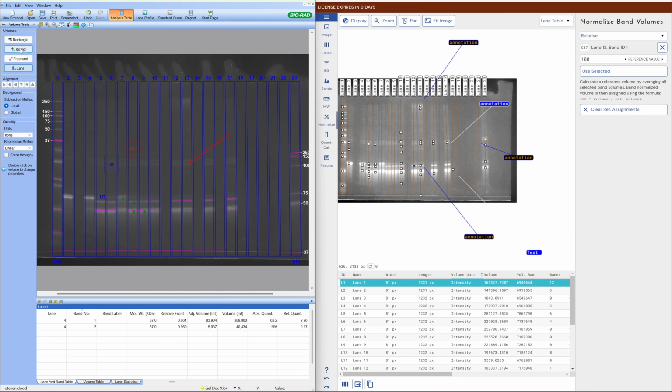So they probably have to cope with things like spots in 2D gels, whereas we have other software to do that. So I'm not going to be able to do a direct comparison because this aligns more with the Phoretix Toolbox product that we've got, that I'll do some videos on at some point. That's more like that than it is like the Phoretix 1D software. So again, I guess you can do quantity calibration on that.